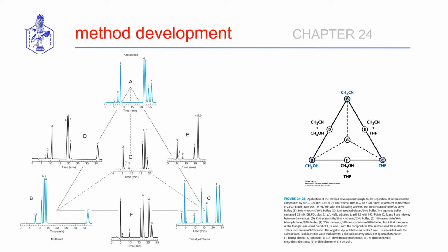As you likely have noticed by now, choosing the ideal parameters with which to carry out a particular separation of a specific sample, and all the choices you have with regard to the stationary phase and then the mobile phase, this is a very complex process. So the process involved in identifying the most ideal parameters for a particular separation is called method development.